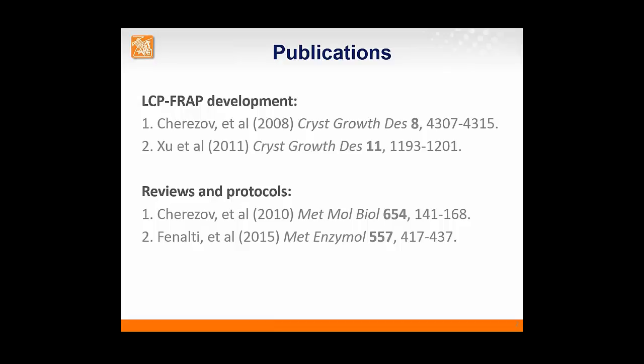I also hope that at least a few of you have read our original publications on the development of the LCP FRAP assay shown here, and also a couple of follow-up reviews and protocols, one of which was just recently published in Methods in Enzymology.